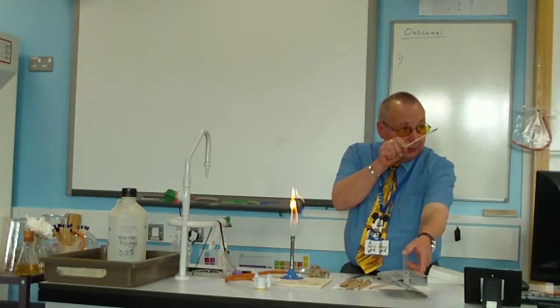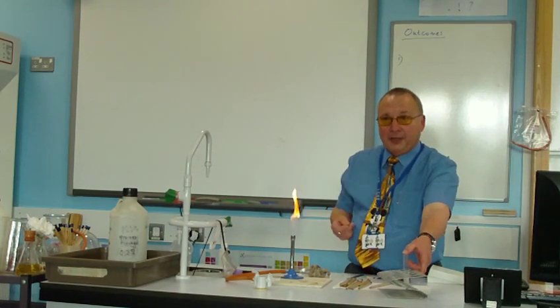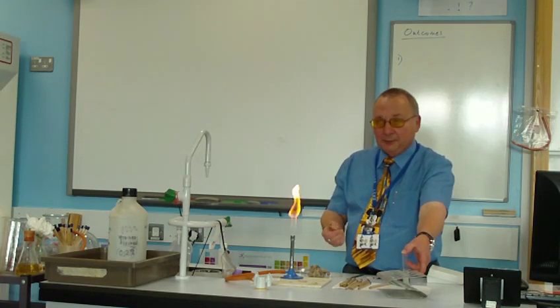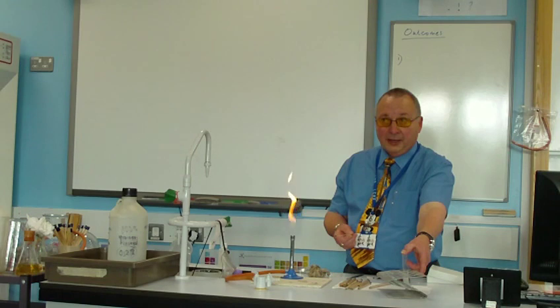I'm going to put some Bunsen burners out, about 3, and leave them on this flame. This is called the safety flame because you can actually see it. I'll put these near the back. You've got to be careful. If you've got long hair, you should have it tied back.